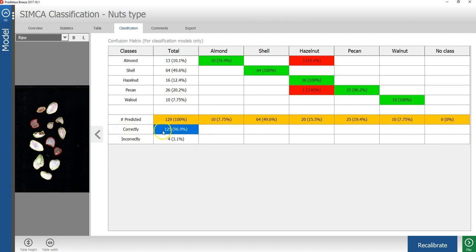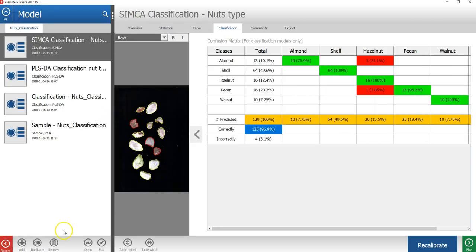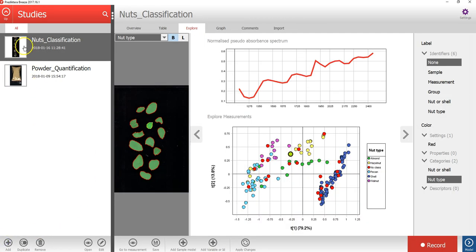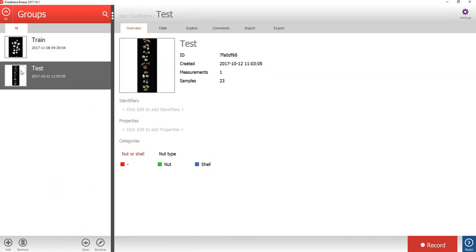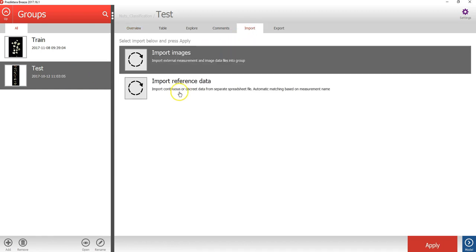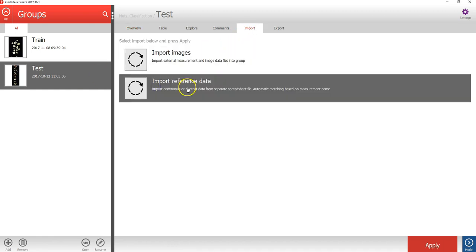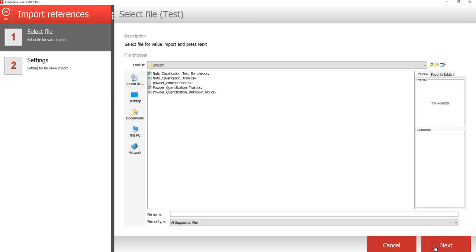To validate the model, you should always use an external test set to see how well it can classify samples that were not in the training data. Let's go back to the record view. I will then open nuts classification study and select the test group this time. I will go to the import tab and then import reference data for this group.